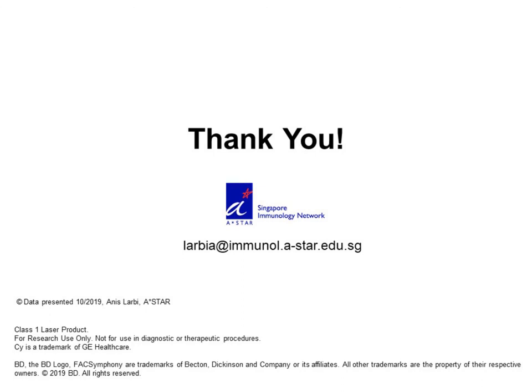Thank you. Next, how do you measure instrument stain index and spillover? Okay, so the staining index is a way to measure the relative brightness of the fluorochrome. It's very useful for ranking which ones are brighter, especially in your instrument. So it's a relative number.